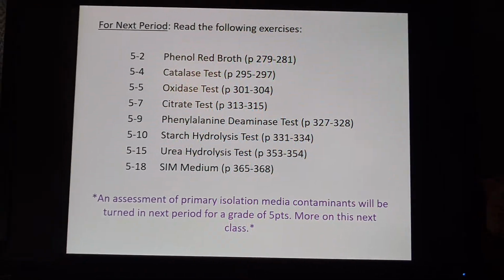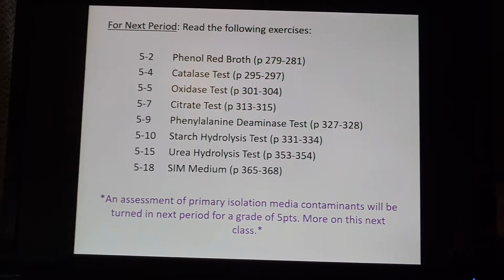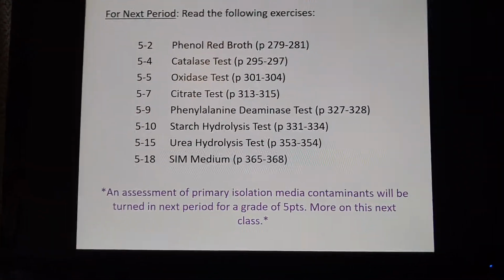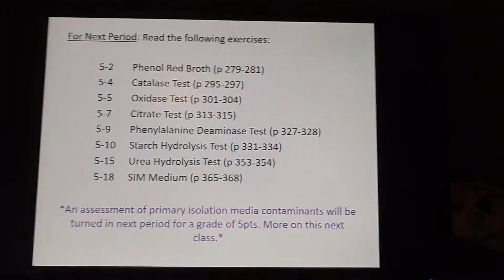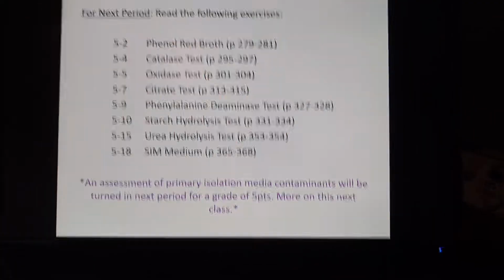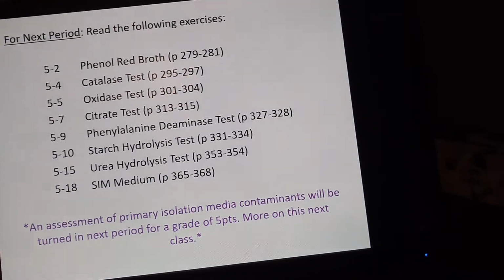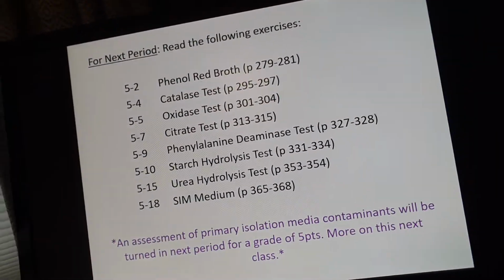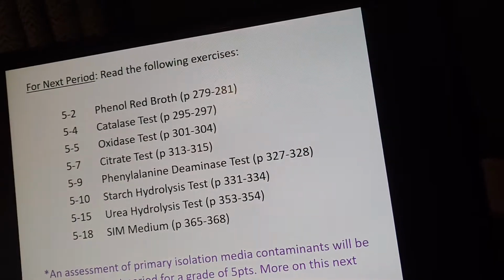There would have been an assessment about how to determine what your contamination is, if you do have such, which, again, you're not getting to do this, but you need to be able to. We'll probably have to give you a scenario where we give you a plate and say, you inoculated with E. coli and staph and maybe even strep, and it was a PEA plate, and only the gram-positive should have grown, but you got something growing on there that shouldn't be.